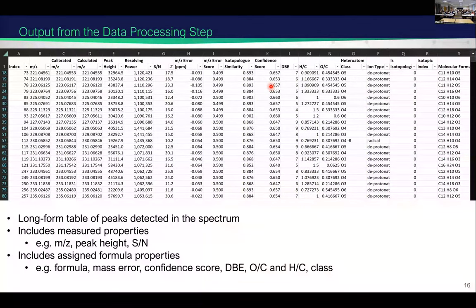Are you going to be providing all of the possible molecular formulas for a peak in the output, or are you also going to provide another one, like, this is everything and this is the recommended by the EMSL instrument experts? That's another excellent question. The question was basically, do we say every possible assignment of a peak, or do we give what we think is best in a sort of more conservative approach?